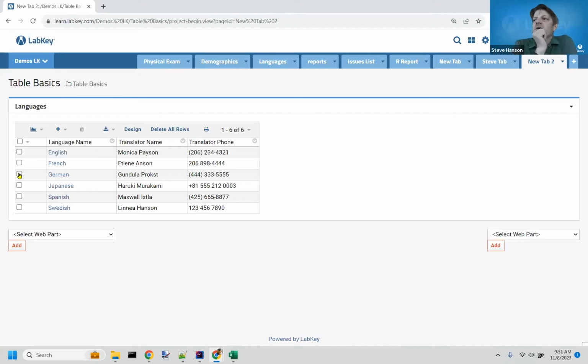Could you read that, Will? Yeah, in a table, data set, list, sample set, is it possible to have a column where the values are unique? So in addition to participant ID, I have a column which accepts only unique values. Yes, in fact, it's a new feature. I've actually never played with it. I'll take a look at it and see if I can find it on this server. But I just read the release notes for our upcoming release, and we've introduced something that's exactly what you're asking for, if I understand it correctly. But I'll try to play with it as we go.